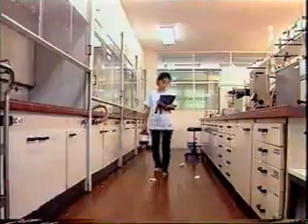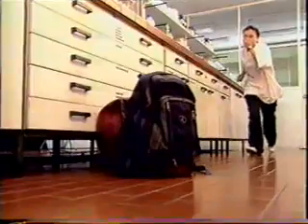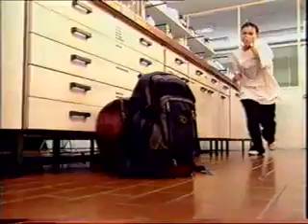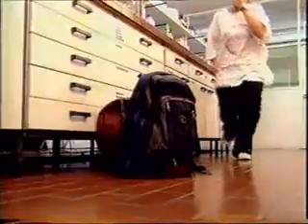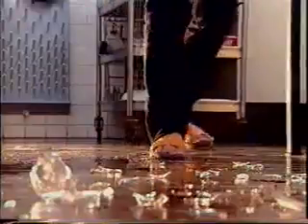Every day, all over the world, people working in laboratories are injured and expensive damages are caused by accidents that could have been avoided if the people had followed safe working practices. This video wants to give you advice on how to work safely in a laboratory environment so that you can avoid unnecessary risks to yourself and others.